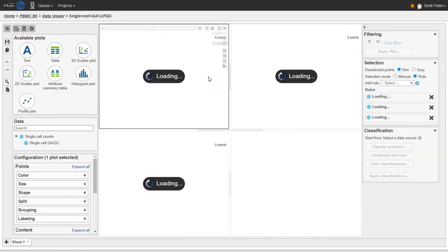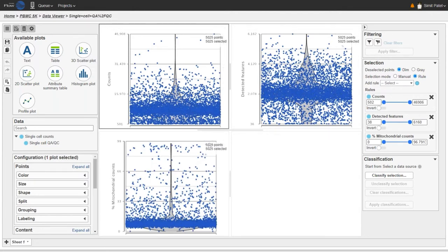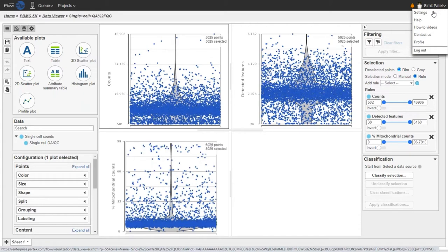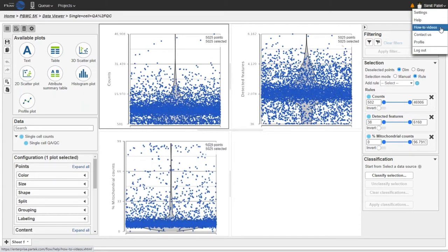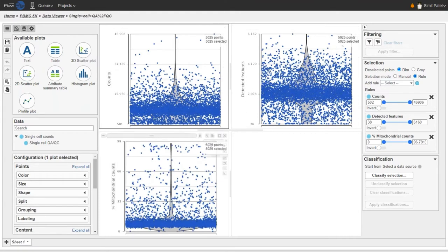This opens the single-cell QA/QC results in a data viewer session. The data viewer has a canvas at the center containing the plots — in this case, three plots — and configuration cards on the left and right sides. We have three plots showing the most commonly used quality metrics for single-cell RNA-seq data: total UMI counts for each cell, total number of detected genes, and the percentage of mitochondrial counts. If mitochondrial genes are missing from the count matrix, the mitochondrial counts plot will not show useful information, but we have mitochondrial genes here so we see a useful plot.